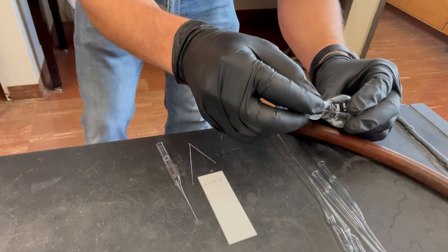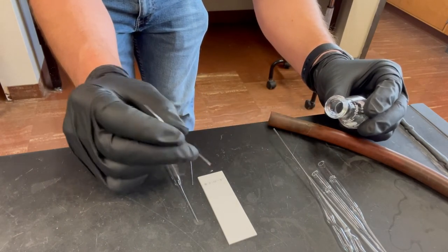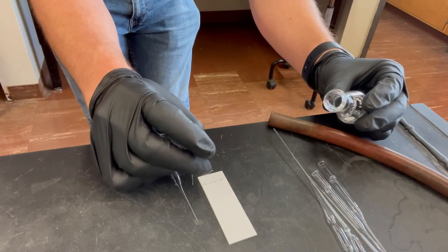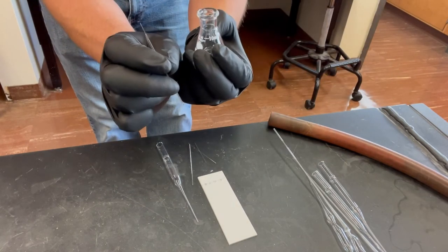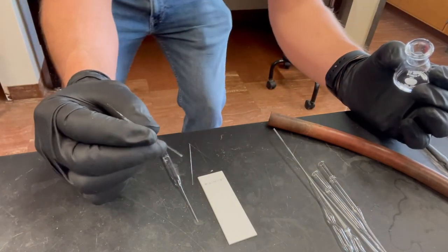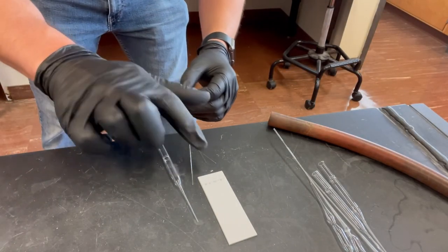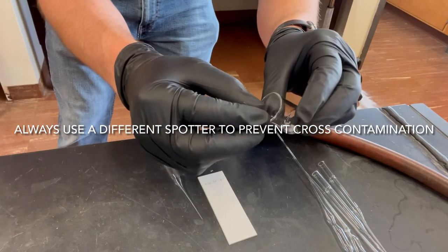Remember when you spot this, you don't want to hold it down. You want to tap, because the liquid spreads out. It looks kind of cool. The liquid starts at the center, and then it expands like that, and you don't want that to happen. You don't want it to get too big, is what I mean, sorry. And then let's try this guy for the other one.